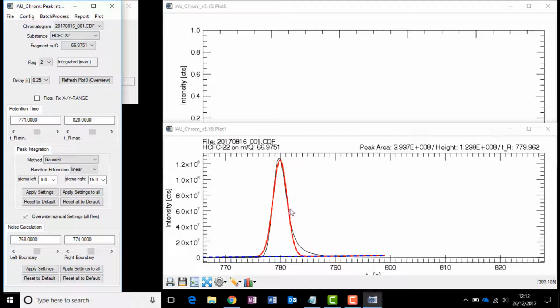And I want the difference between the red peak and the black peak to be about the same for every sample. Then the blue and the red dashed lines are the baseline, and then the black line, which is kind of difficult to see, is the part I'm actually controlling. So if I change this to 20, you can see it's now sticking out the end.